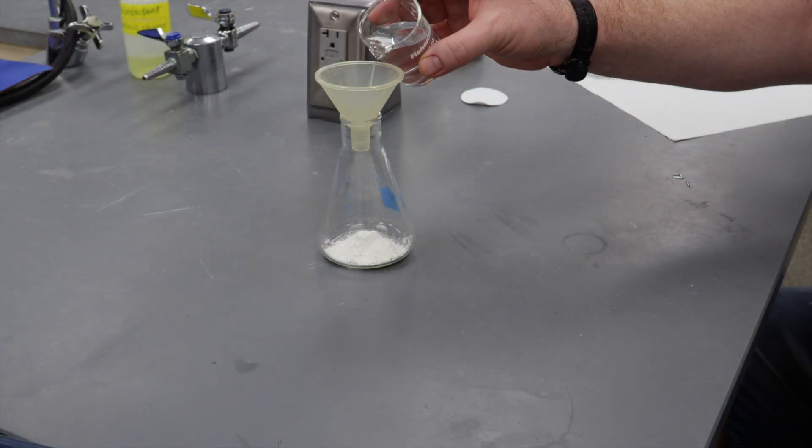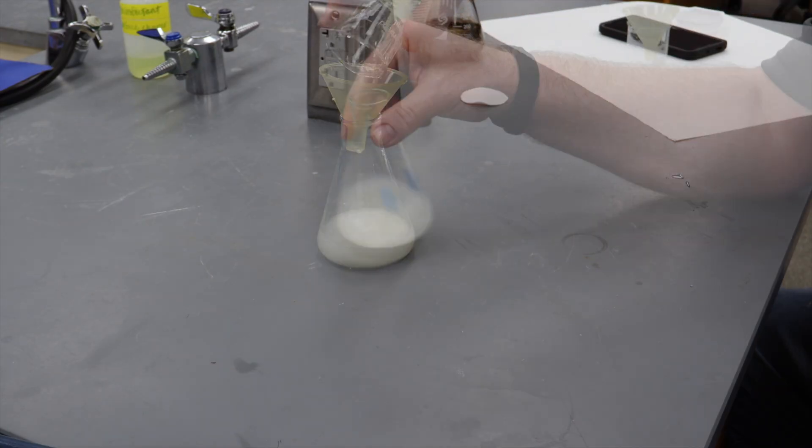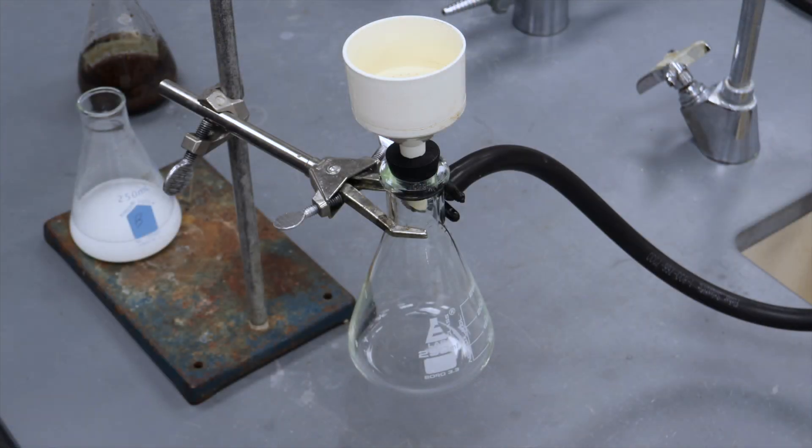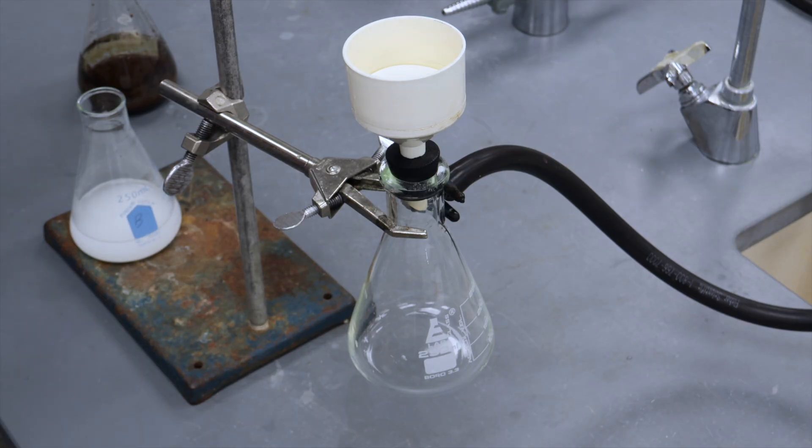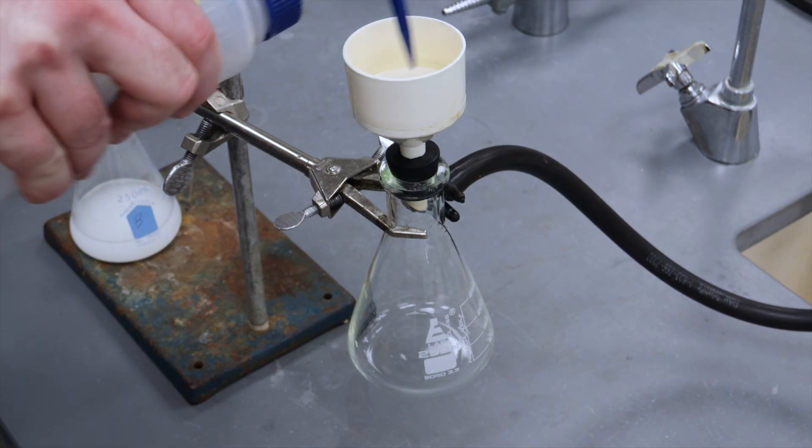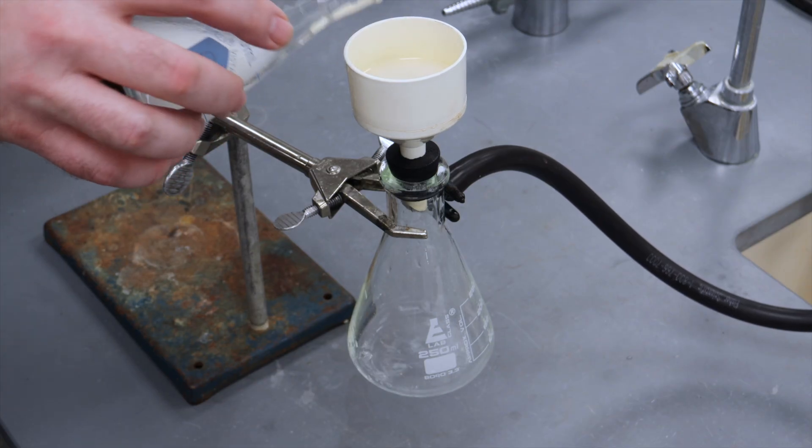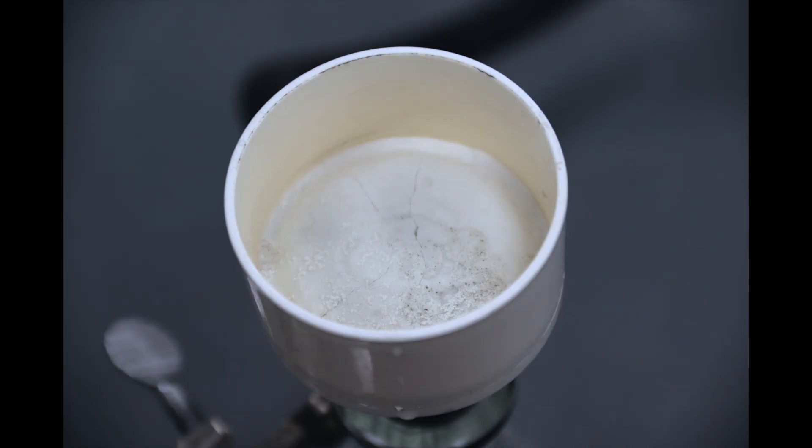To prepare the filter aid, you need to create a slurry of your solvent and the diatomaceous earth. Next, set up your vacuum flask, Buechner funnel, and filter paper so that no solid can get through the Buechner funnel. Then, carefully pour your sea light slurry through the filter paper. You want to make sure that you get a nice, even filter cake made up entirely of your filter aid.